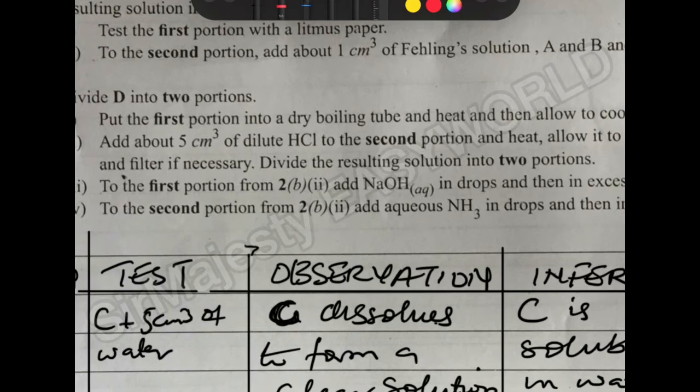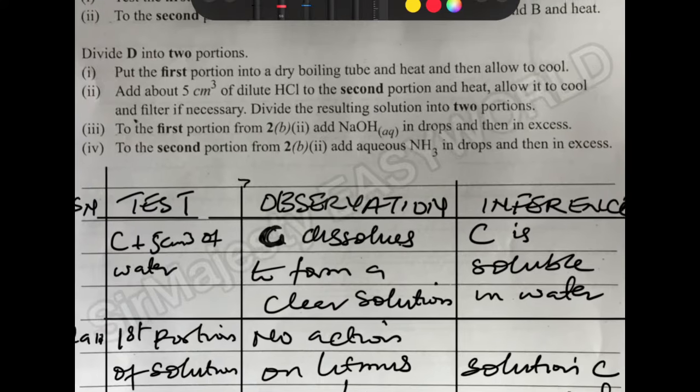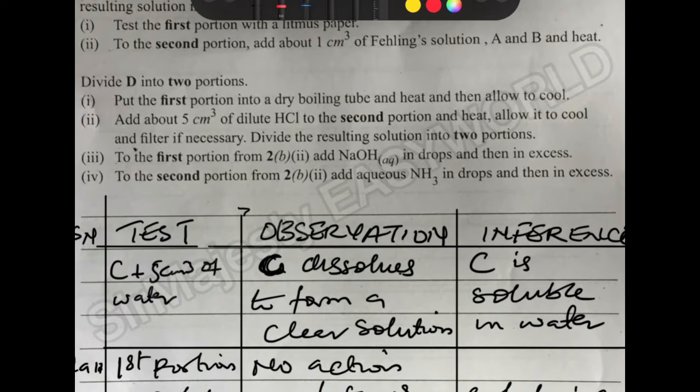So what I'm trying to say here to my fellow chemistry teachers, for those that go for audition, I don't have so much problem with this, but there is a slight problem, which is the strength of this HCl, because dilute is not specific. Unless they specify what they mean by dilute, there is no strength that you can comfortably call dilute. So a teacher can provide 0.3 mole, 0.2, 0.5 mole, even 1 mole per dm cube HCl is still considered dilute. Yes, of course.